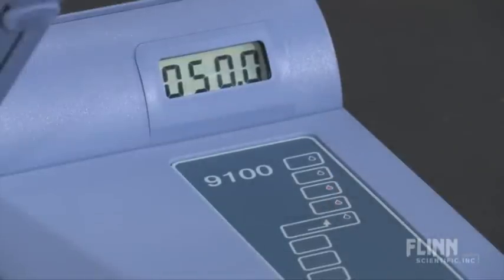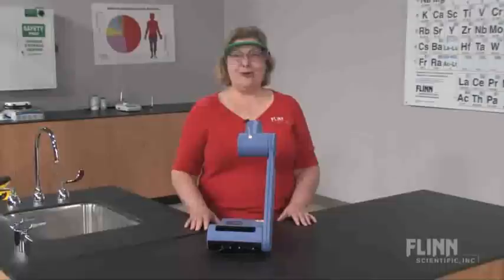Simultaneously measure and record up to four temperature data points for three samples without looking up or away. The eyepiece has 8x magnification and a built-in light for a sharp focus on all samples. Your whole class can now measure melting points.